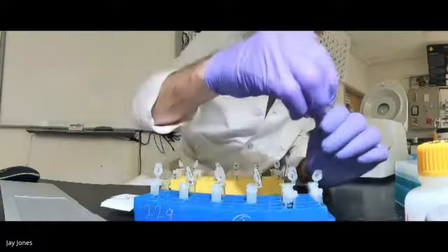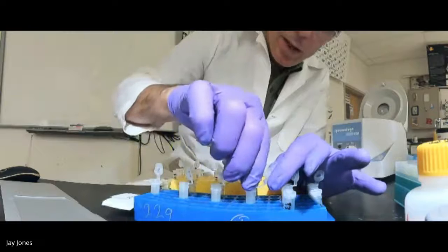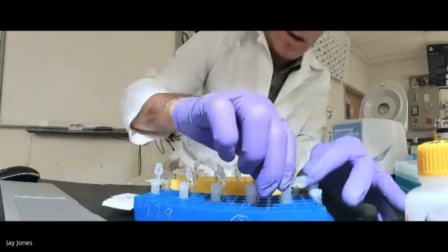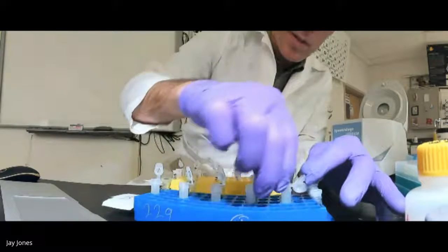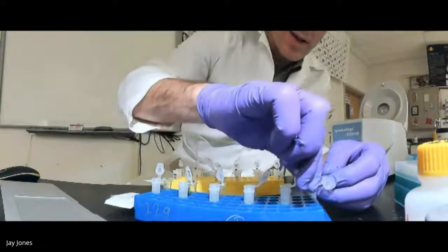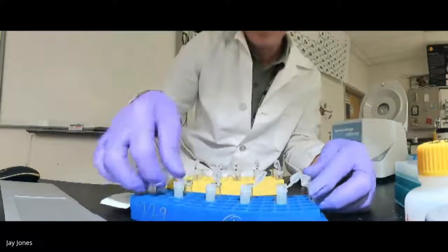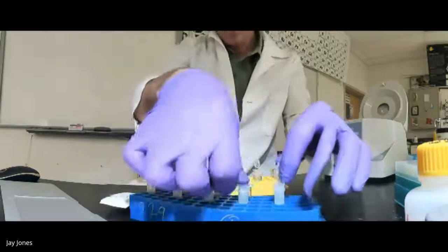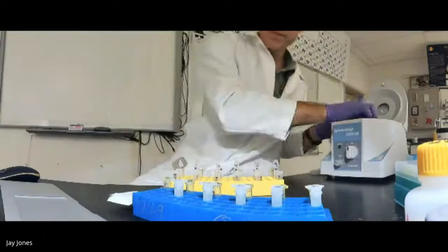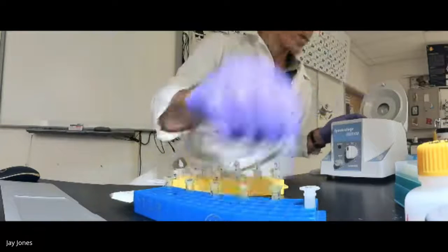The white stuff is precipitated soap and membranes and larger nonpolar molecules. Now you may go, why are they at the bottom? Because the soap aggregates and precipitates with them because the soap is not working anymore, and we centrifuge them down to separate them from the aqueous phase. I'm going to close these up. I'm going to put this whole assembly in the centrifuge. I'll show you in a minute.